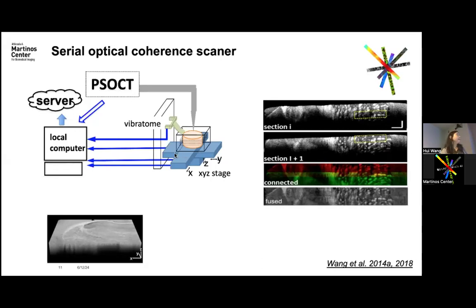We add a vibratome tissue slicer into our imaging system, because PSOCT images from the top of the brain and collects light backscattered to the system. So we can image the top portion of the sample like this slice here, and then we can slice off what's been imaged and get the deeper regions exposed again. So this is the next portion, and then slice again and image deeper, and slice off again until we finish this whole volume.